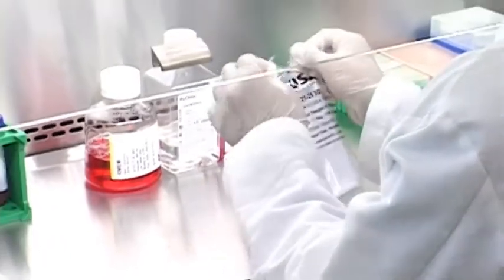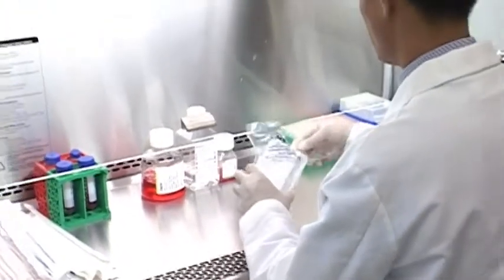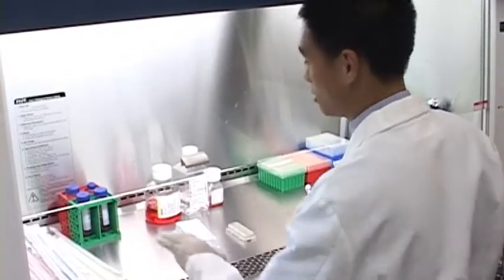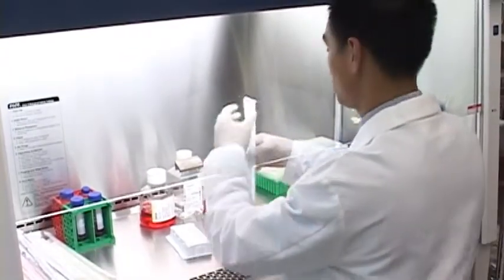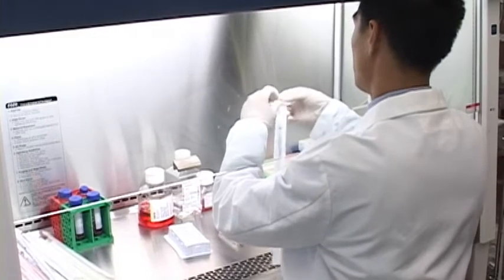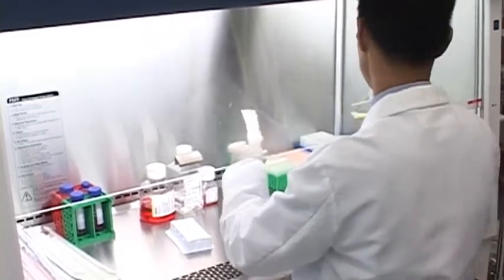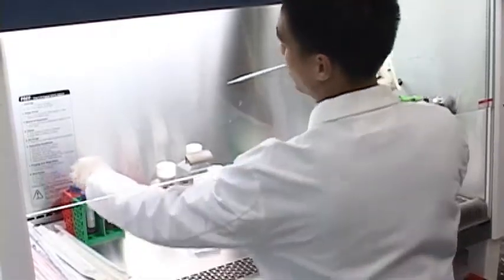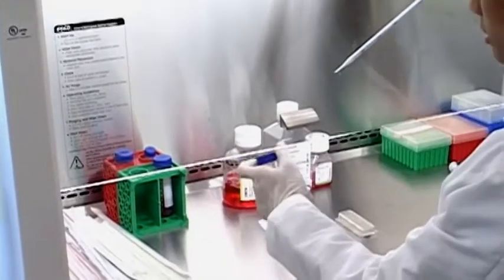So in our case, we'll be adding 150 microliters of just plain media without cells into each of the wells. Now in general, we recommend going no lower than 150 microliters. And this is just to ensure that the entire bottom of the well is in fact covered once you obtain your background measurement.